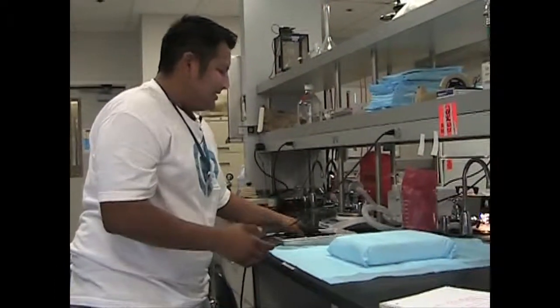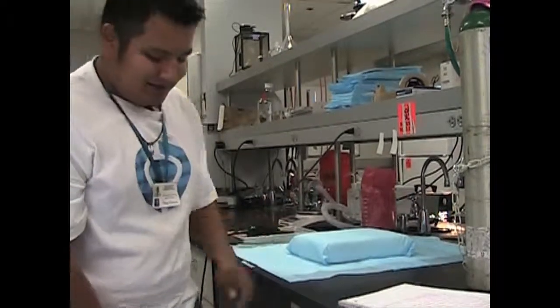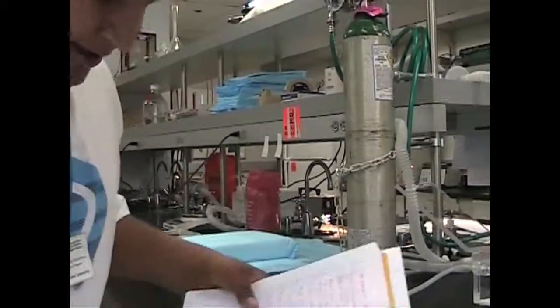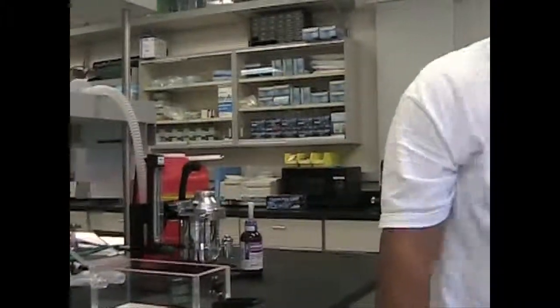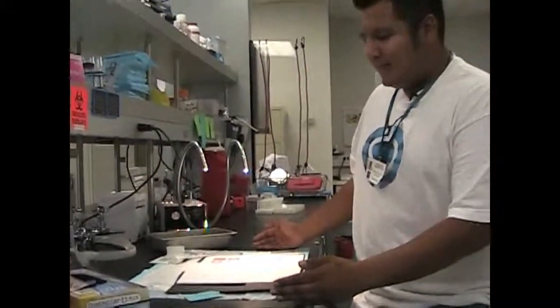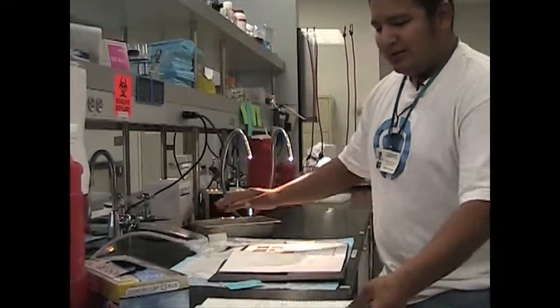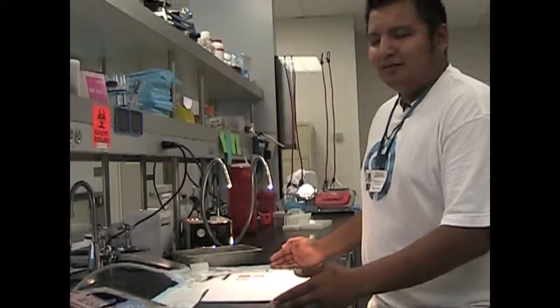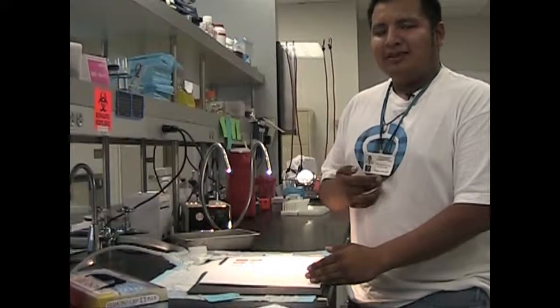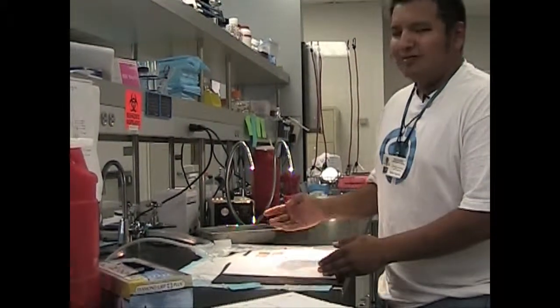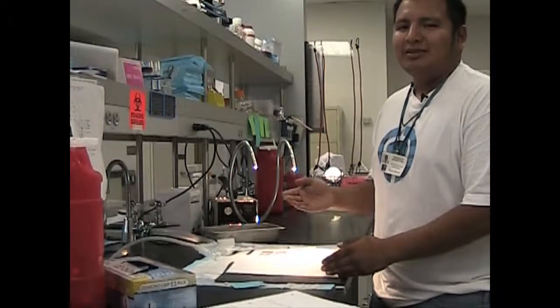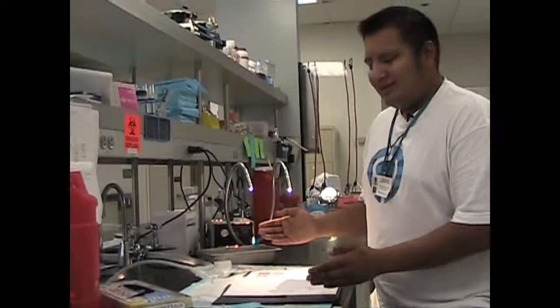Once they're shaved and sanitized we bring them over here to the surgery area. This right here is where the surgery happens. Once they're unconscious we put the nose cone on them, and when we make the incision at the abdomen we put it at one percent. The reason we lower that is because you don't want your mice to overdose and die, and that's really bad.